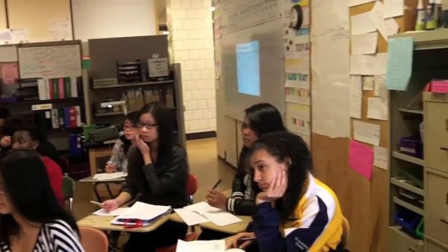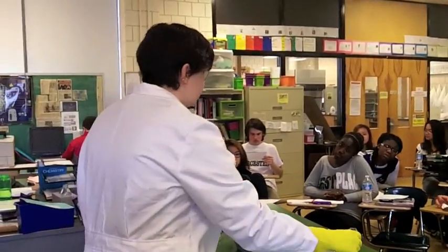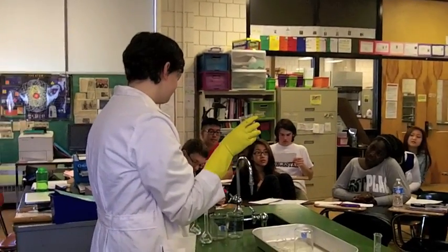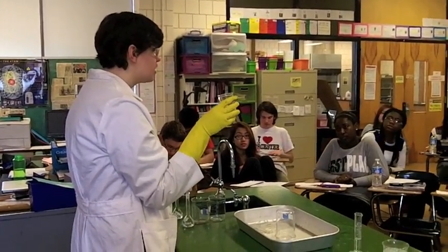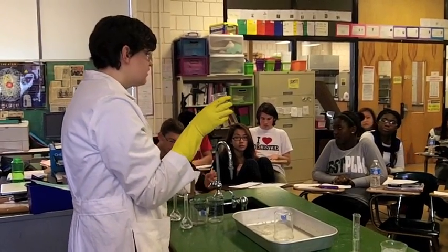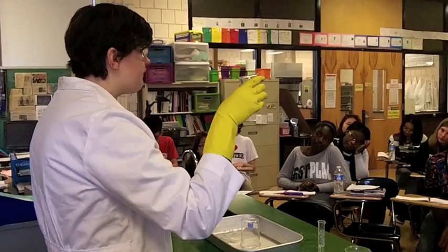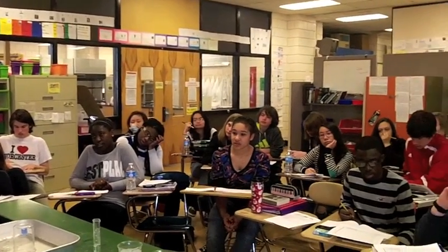Okay, so we have sulfuric acid and sugar. I want you to think back to biology class: what kind of compound is sugar? Carbohydrate. So do you remember what our formula for sugar is? C6H12O6. Good. So what elements do we have in carbohydrates and sugar? Carbon, hydrogen, and oxygen. Good.